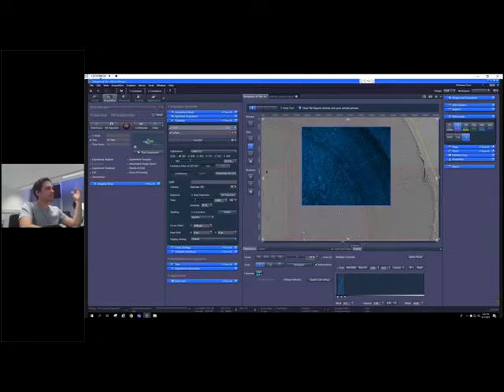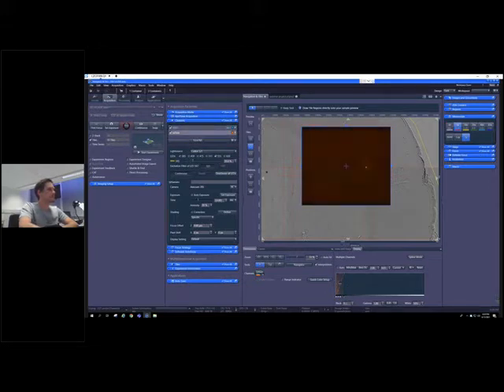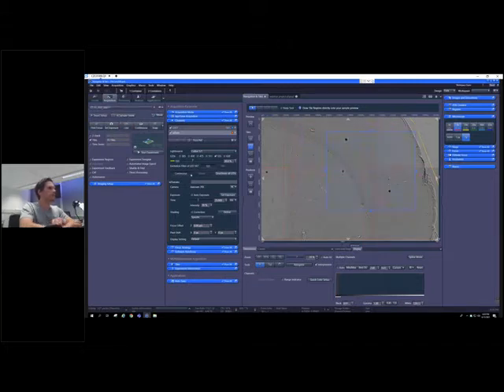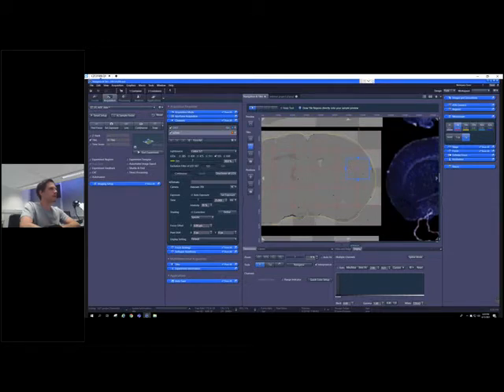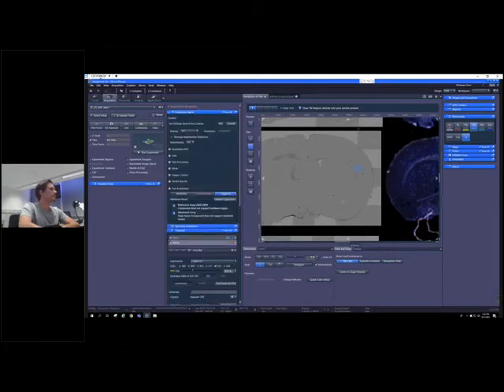So basically, the sections are stained with DAPI on the one hand side, and secondly, there's a sparse neuronal labeling. So you can see a few neurons here, one here in the center, which are expressing fluorescence information. And in the next step, we would like to run a preview scan, for example, based on higher magnification to get those neurons very nice. And therefore, I'm switching here directly in the software my hardware, and I'm assigning an experiment setup.